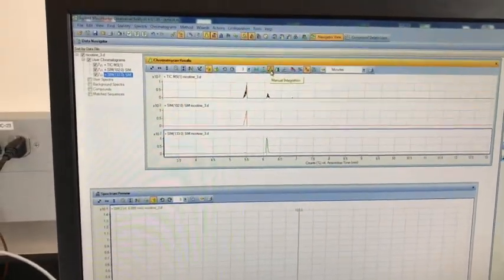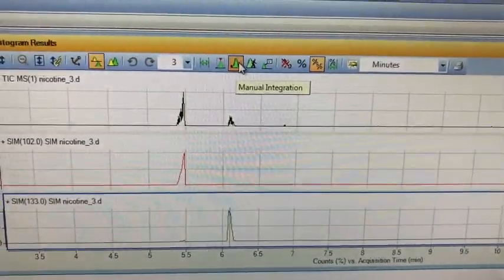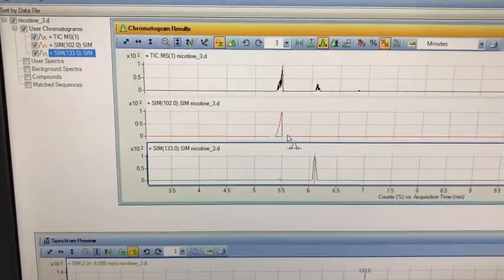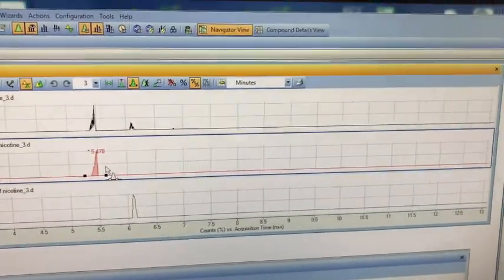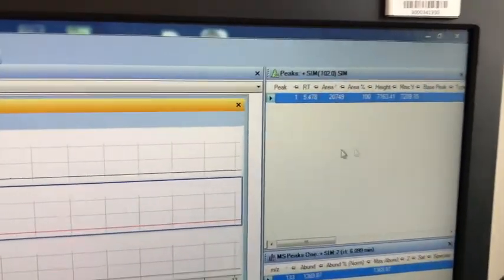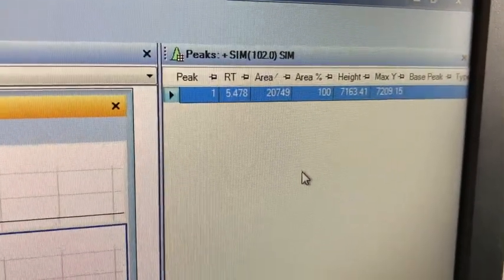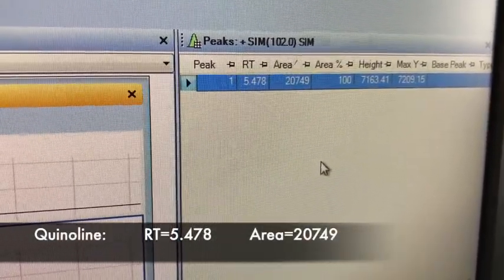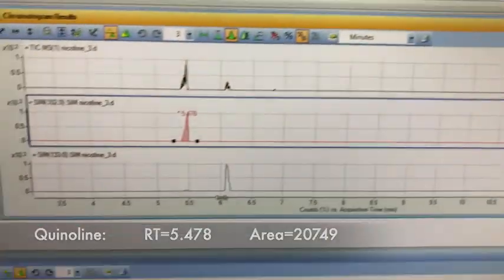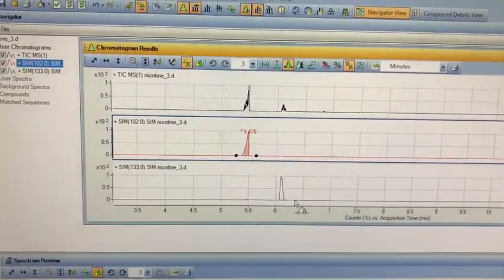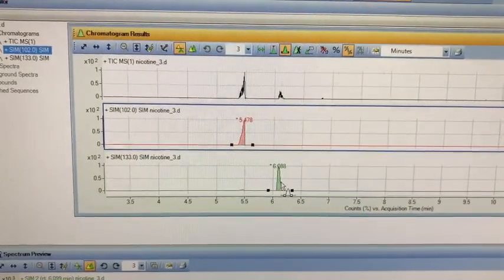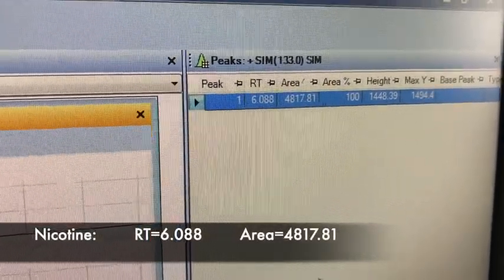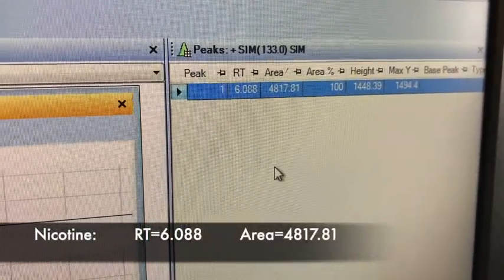In order to get the area, we're going to do manual integration. Let's manually integrate the quinoline peak first. I select that, double click, and we get the area count. For retention time 5.478 minutes, which was quinoline, my area count is 20749. We're going to do the same thing for nicotine — integrate it and double click. For the retention time 6.008 minutes, my area is 4817.81.